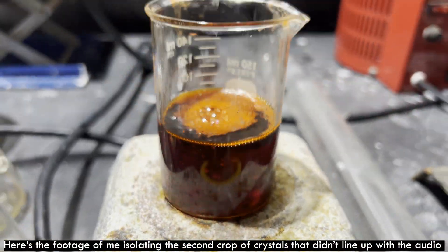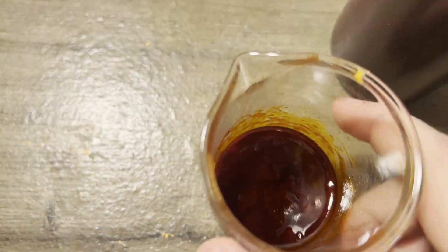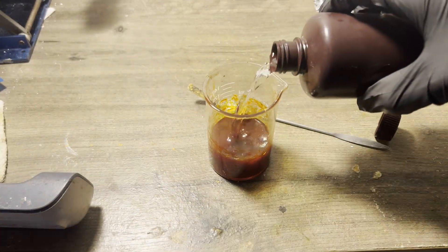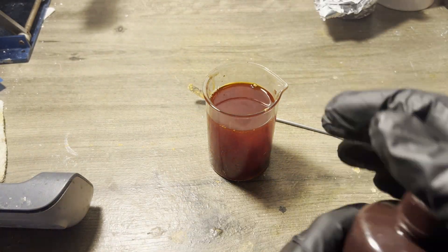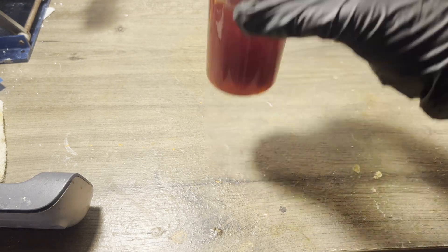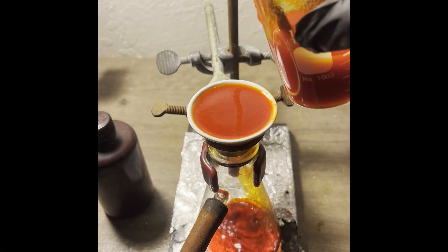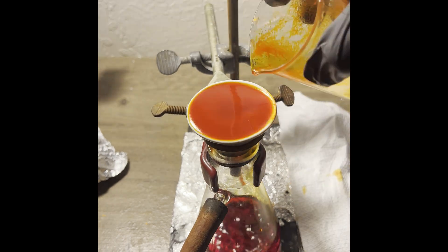I added sulfuric acid and some water to the toluene distillate to neutralize the aniline and try to recover it as aniline sulfate. So far I've gotten 34.74 grams, but I'm currently working on recovering more, as well as hopefully some more of the terephthalate. I will edit the description to reflect that.